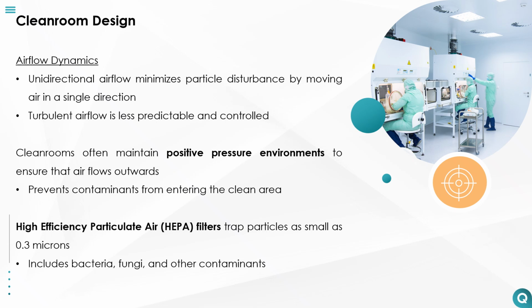Many cleanrooms maintain positive pressure environments, ensuring that air flows outwards. This setup prevents contamination from entering the cleanroom, maintaining cleanliness. HEPA filters are integral to cleanroom design, trapping particles as small as 0.3 microns. This includes bacteria, fungi, and other contaminants, ensuring high air quality within the cleanroom.